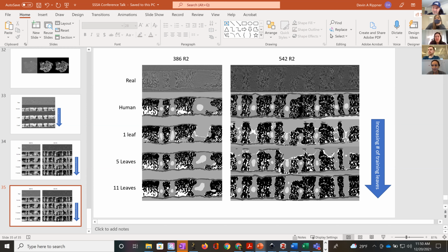And depending on the condition, if you're looking at structural changes, the model recognizes and annotates species well, so you can trust the model for structural changes within the species or within the genotype group.